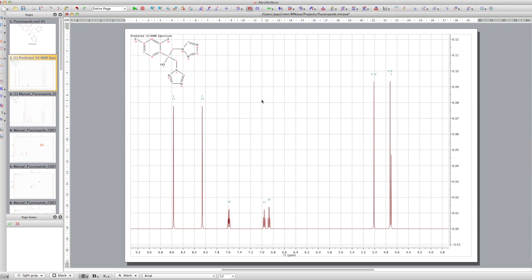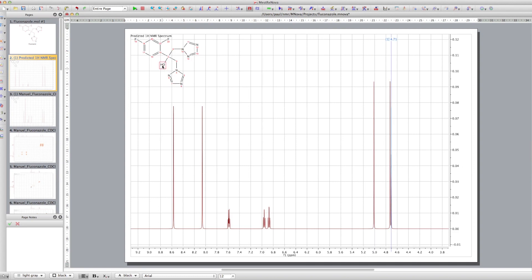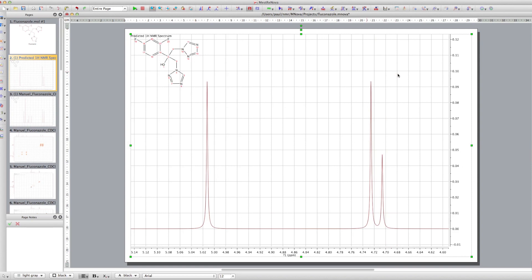This is a predicted spectrum, so it's predicting pretty much what you'd expect. You've got some CH2 groups with two protons on there, and they're coming around 5 ppm because they're next to the nitrogens. We've also got this OH peak that's being predicted, so just zoom in on this region and you'll see it a bit better.